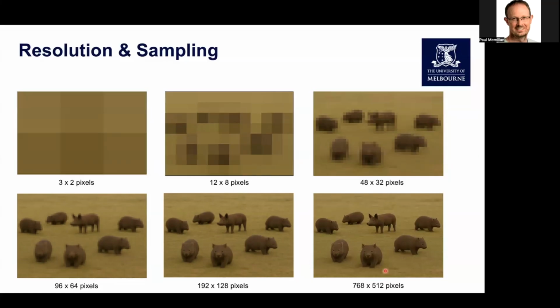So the take-home message I'm trying to transmit here is that we need to think up front, when we're acquiring the data, about what we will need to analyze at the end on that data. So it's worthwhile thinking about it up front, making sure you've captured the data correctly. Don't get to the end of your experiment and then work out you haven't acquired it properly.